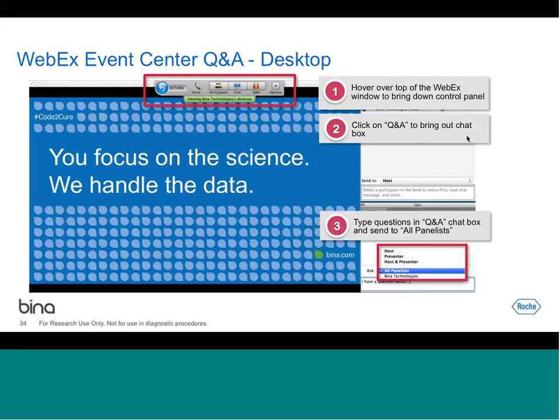Another question, do you need to tune each individual variant caller according to different read depths, et cetera? So we don't do too much tuning in our experiment. Now, we are aware that if you're doing deep sequencing targeted data sets, then some of the tools need to be tuned to that, and that should be done. The important thing is to maintain the same configuration, same parameters in your training data and your test data. We did not do too much tuning ourselves, simply because our data set is pretty typical, but I know that's not always the case.